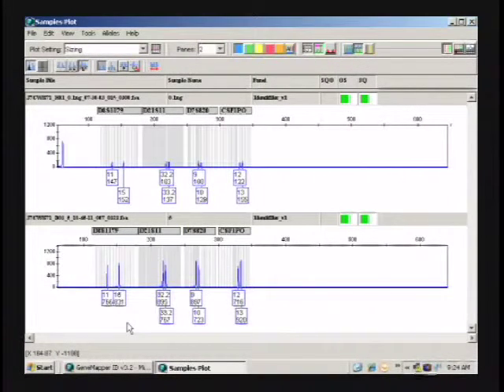Okay, so the beginning data is 150, then it went up to 766, 163 to 895. This one's 1 wash. So the beginning data is probably about the same, but obviously the increase was a lot more.